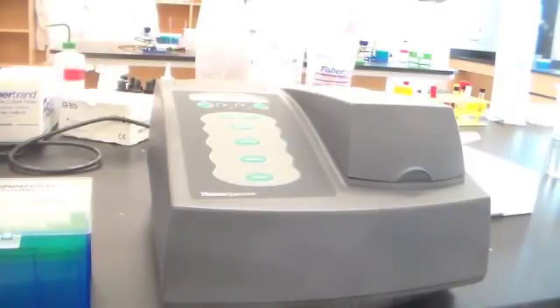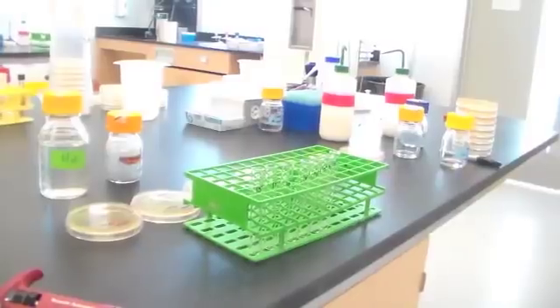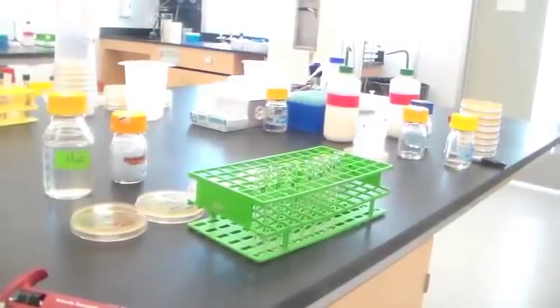So in the next portion of this, at this point you're not counting viable cells, you're counting total bacterial cells. In that cuvette, a dead bacterium will absorb or diffract light to the same degree that a living bacterium will. So this is in essence looking at total number of bacteria. In this particular case, since the culture was just inoculated, we can pretty much assume that all of the bacteria in there are alive. But now we're going to do a viable count.